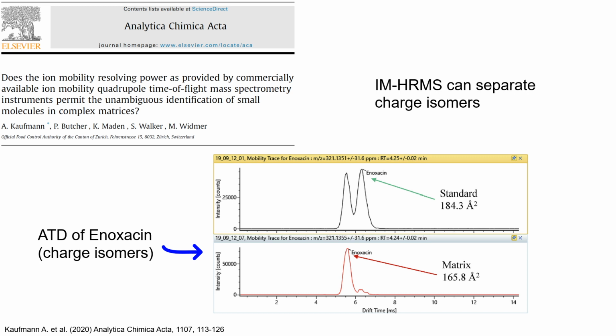Another consideration is about the presence of charge isomers, and charge isomers can be separated using ion mobility and will produce a split arrival time distribution for an analyte. Therefore, the CCS of two protomers, for example, might change by over 2%. On one hand, this is great because we increase the peak capacity and we are able to detect two different species and potentially correlate the preferential formation of one charge isomer over another depending on the experimental conditions and use this information to our advantage.